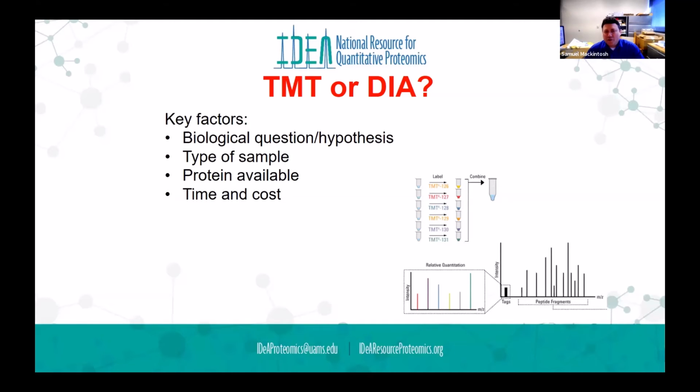So probably in the pull down experiment, we wouldn't specifically look for the phosphorylation sites. We would just look for what changes in terms of protein interactions. And we would probably do that by data independent acquisition, because that's more tolerant. Usually with pull down type experiments, you're limited in terms of the amount of sample you can isolate, so you generally don't have enough for isotopic labeling.